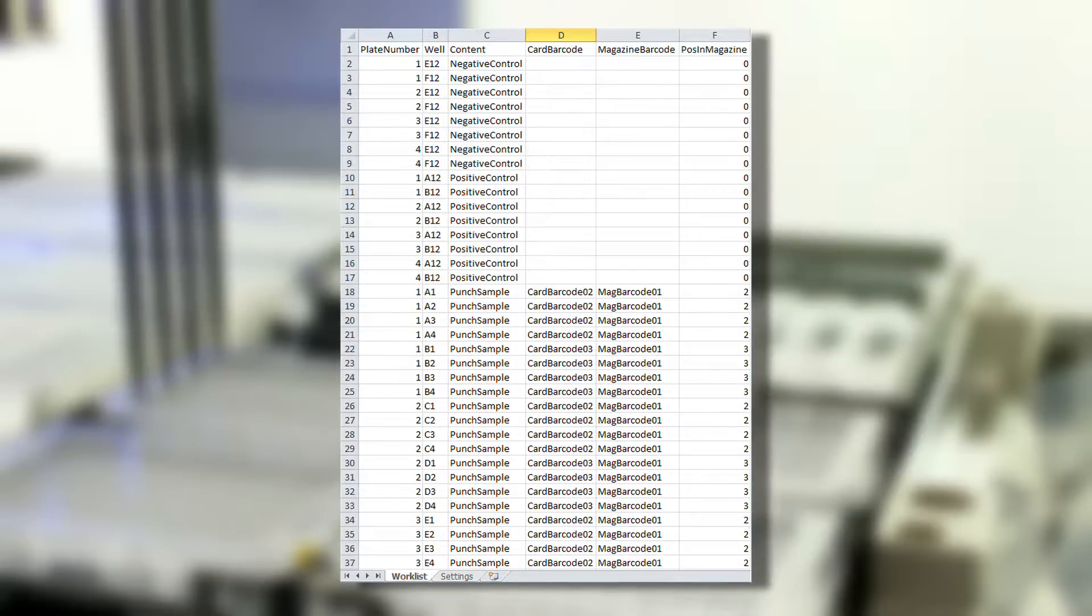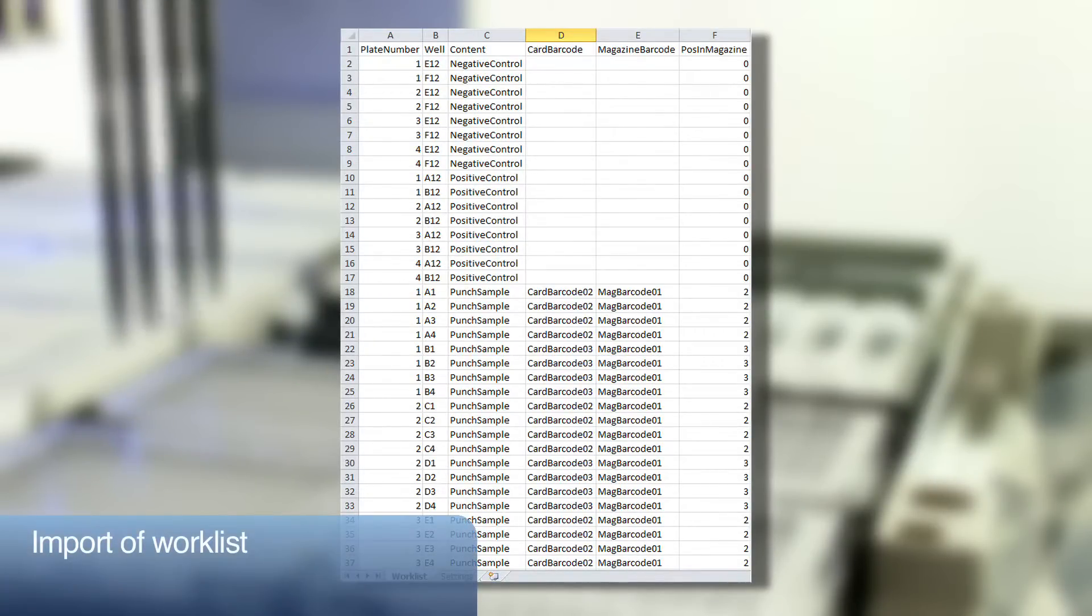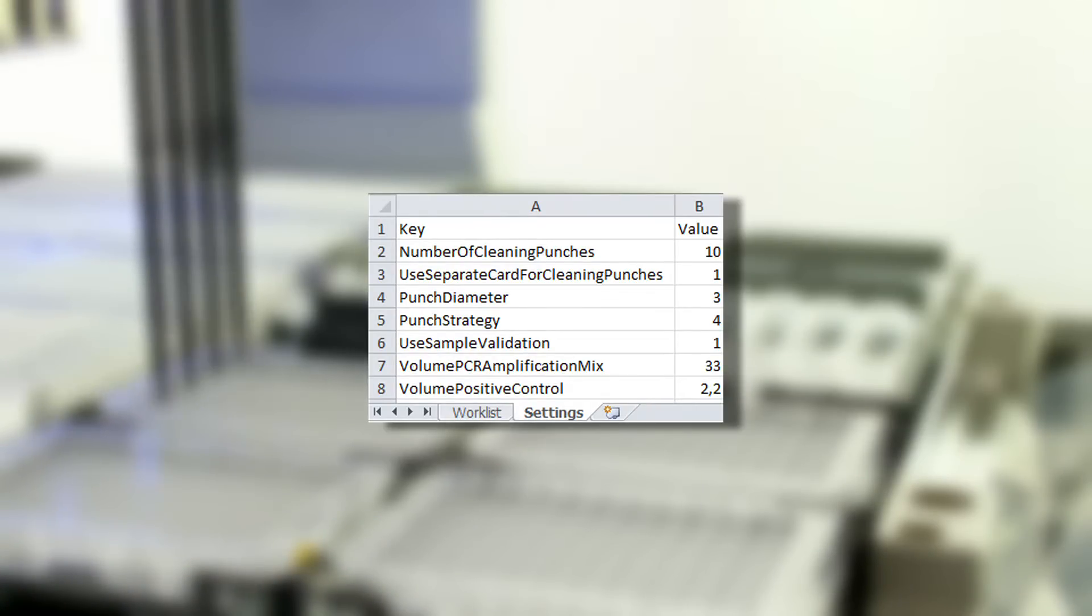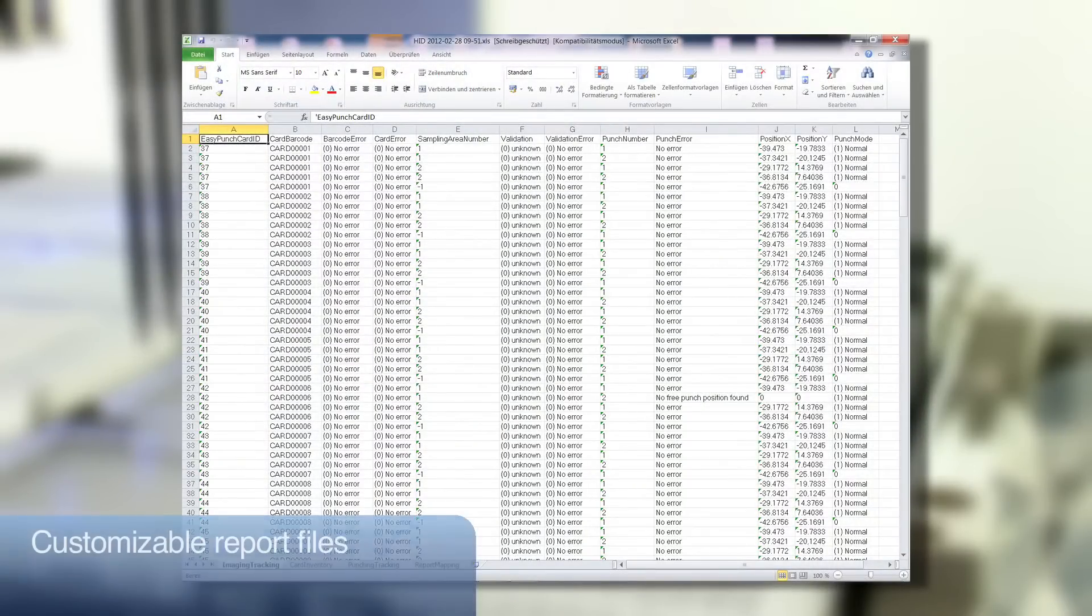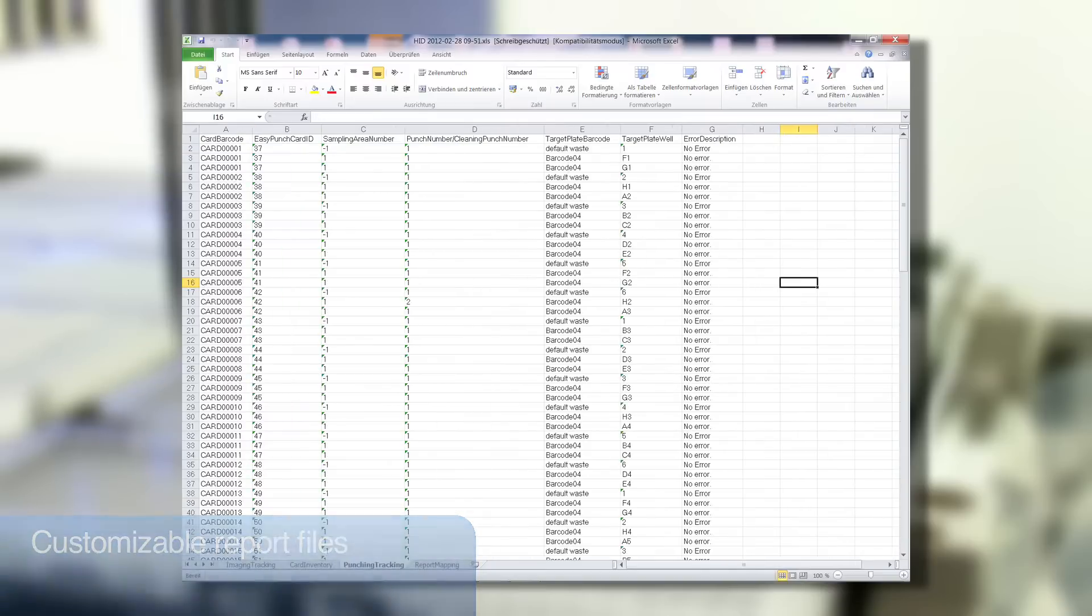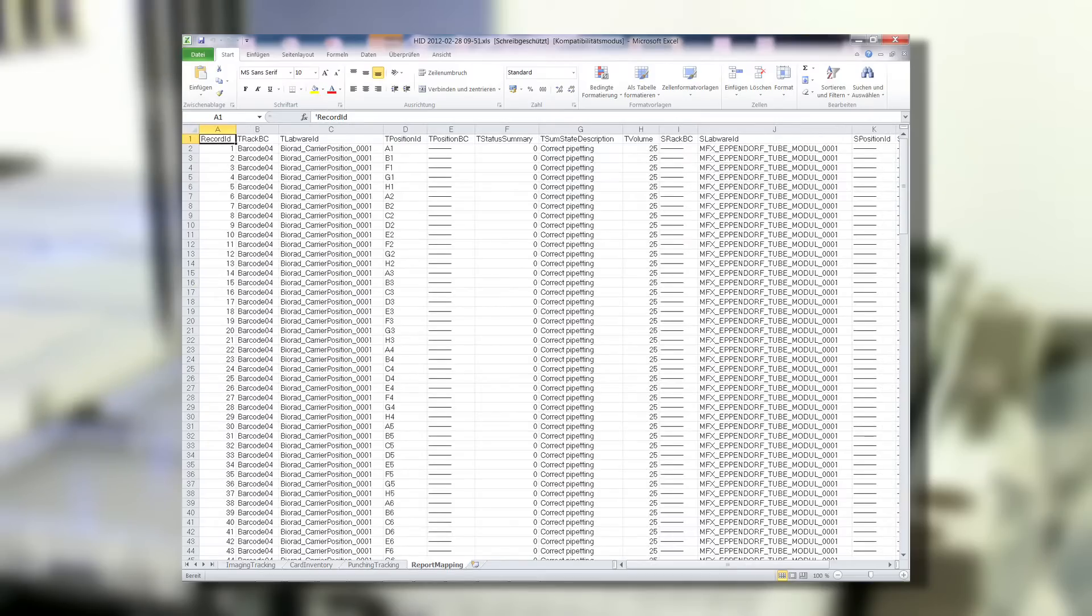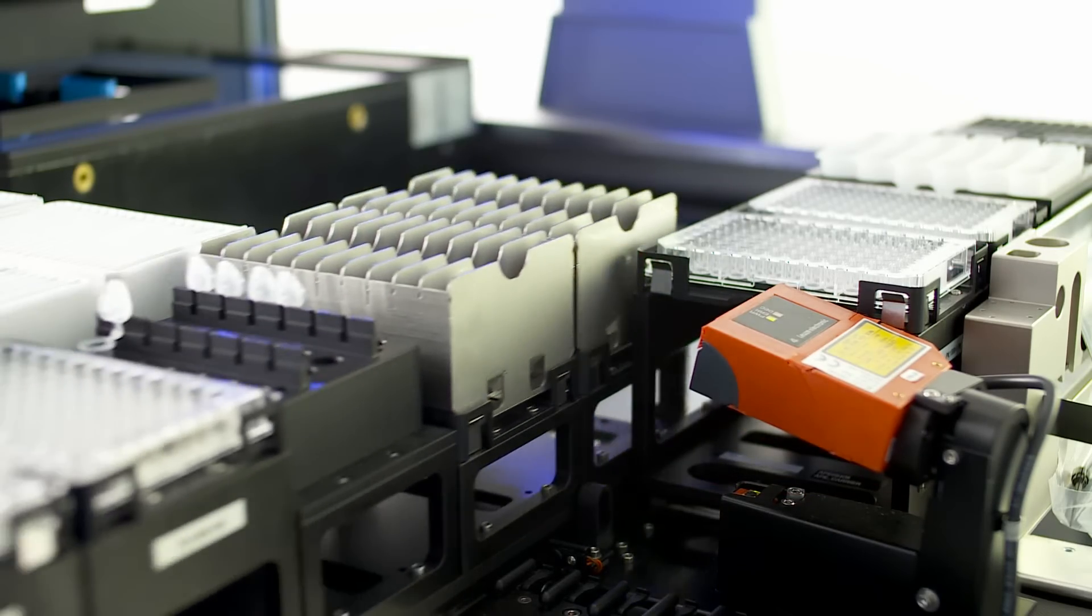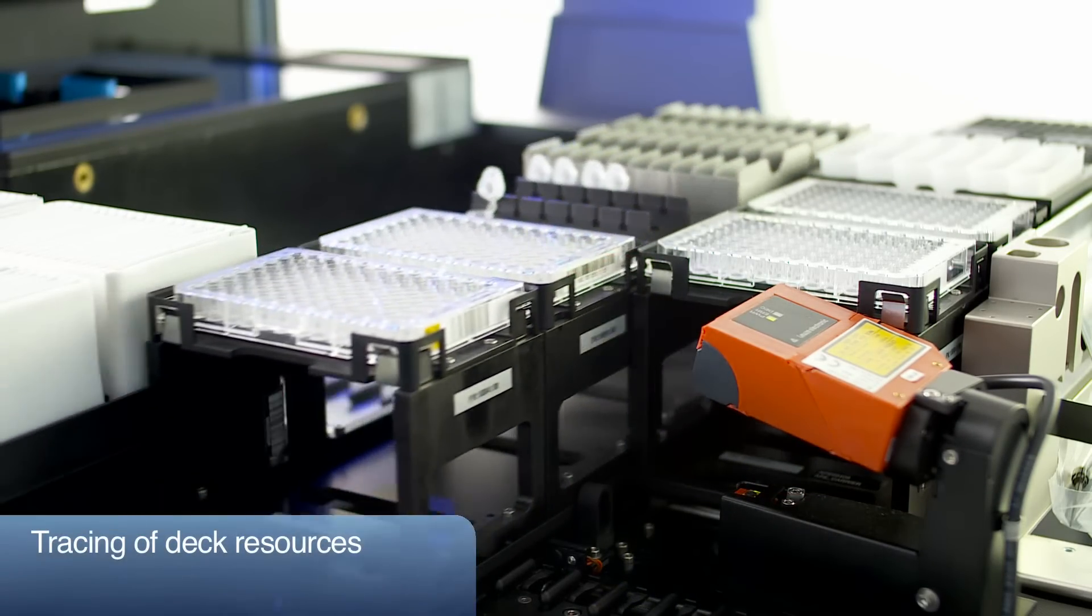For each run, worklists generated by an LIMS system can be loaded to specifically position the samples on the plate. Easy transfer of the trace data by an export file customized for your LIMS makes sure that you have all the data about the process samples stored centrally. One of the most important sources of errors is mixing up of samples.